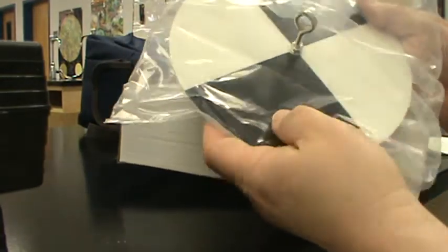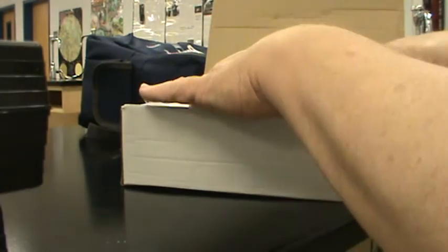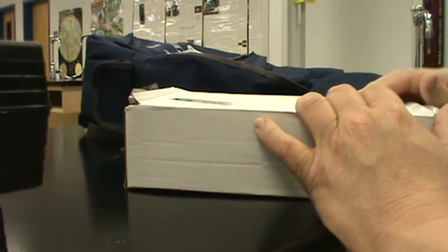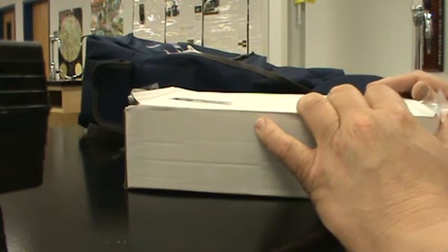In the United States, you have 2 locations, Crater Lake in Oregon and Lake Tahoe on the Nevada and California border. Both of those lakes are used as the benchmarks for water quality, and these discs come in very handy. The deeper you can go, the better the water quality.